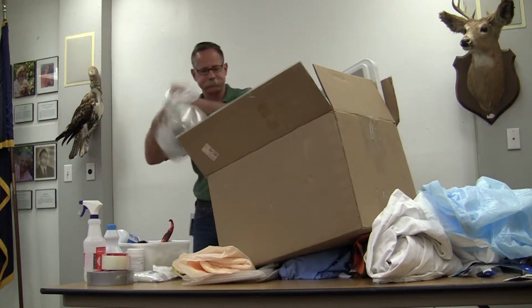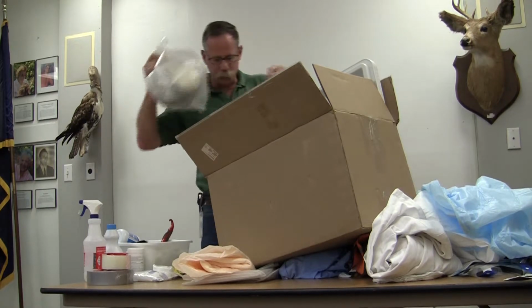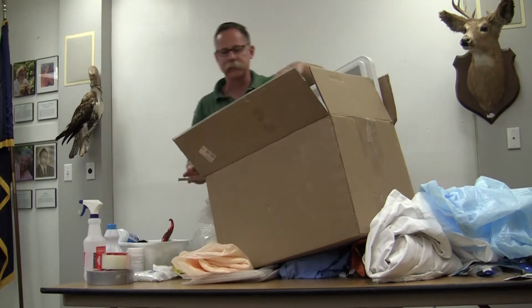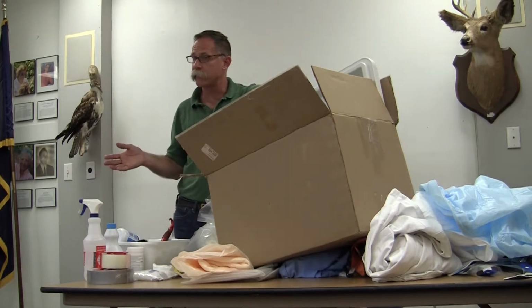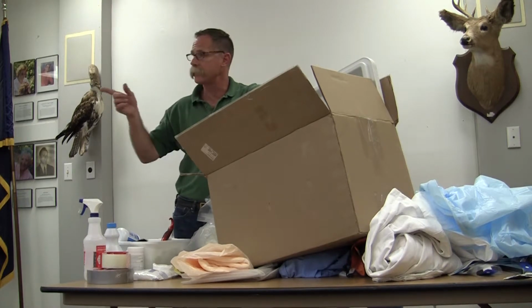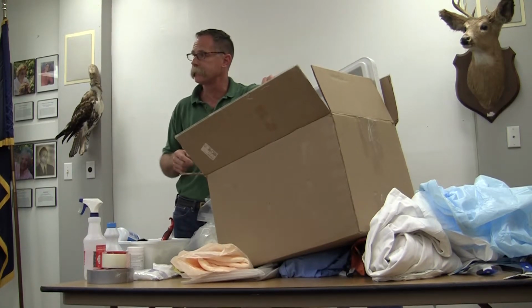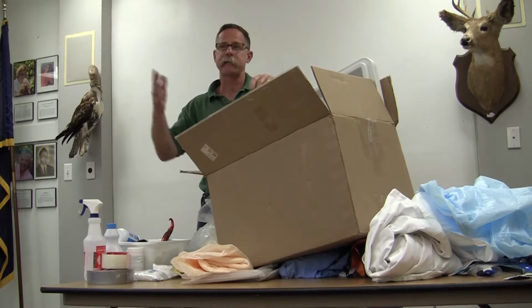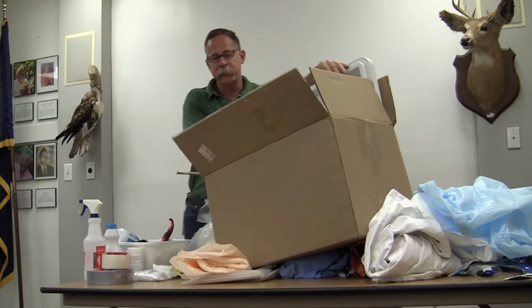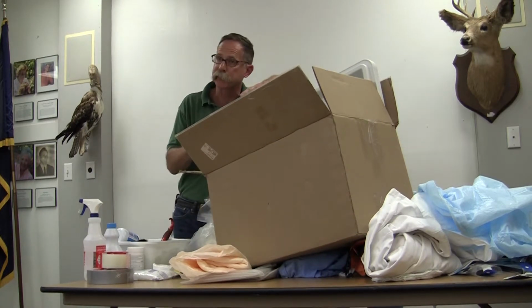So you've got your, where'd my raccoon go? You've got your specimens, and you want to put them in the cooler. The first thing, this is a plastic cooler inside a cardboard box. These coolers are rigid. We also have styrofoam coolers inside boxes, and I've got a couple here in our truck that you're welcome to take. The rigid ones like this, the picnic coolers, are really nice because they're crush proof.